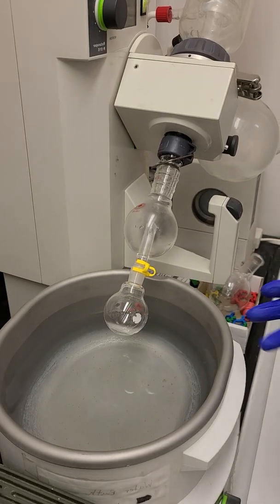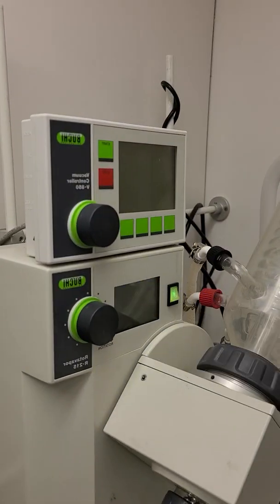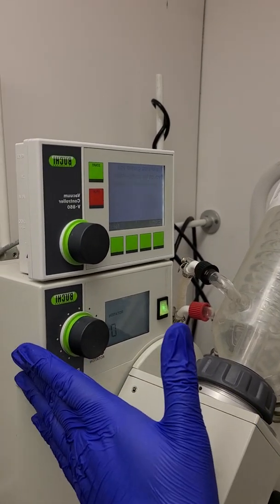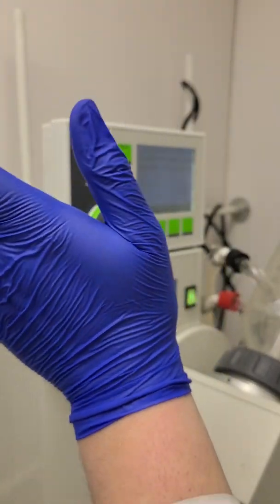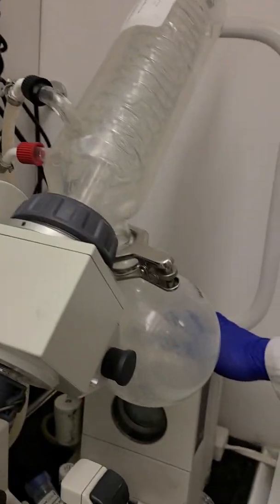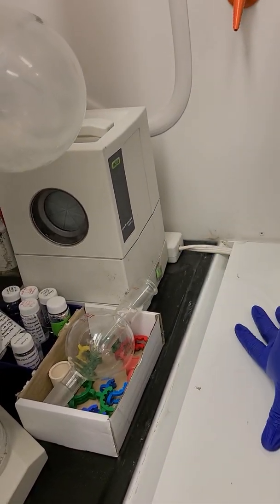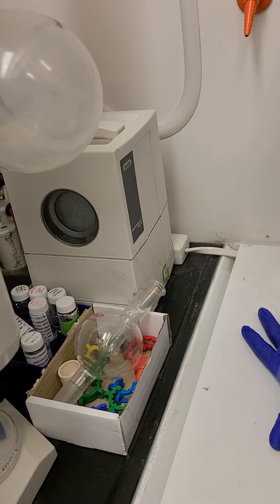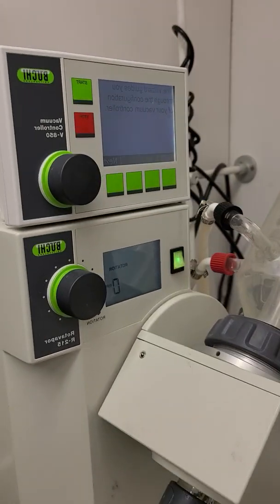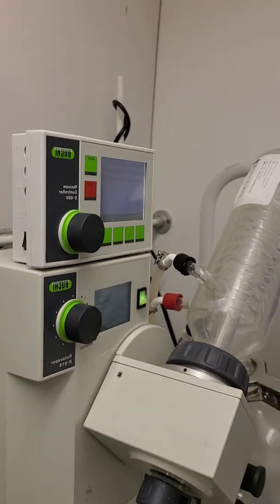Okay. The next step is to turn on the rest of the machine. So here's the power. This is for rotation. And this is the vacuum controller. The vacuum is to the left here. The power switch is right here, and you can just turn it on. Okay. I'm going to turn that off for now so you can hear me.